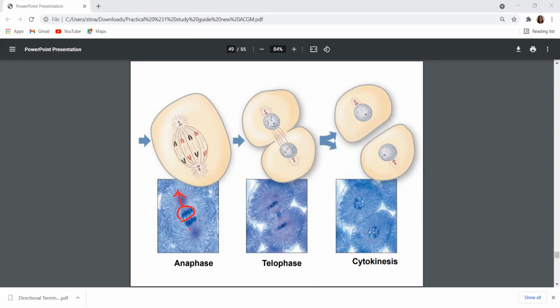And then you have these chromatids or sister chromatids being pulled to this end of the cell, but they're pointing towards each other. So when you're looking at it, it looks like a bunch of fingers pointing to each other. So it kind of looks like this right here. Okay, where you see those sister chromatids being pulled to opposite ends, and the 2 sets of sister chromatids are facing each other, but you can see a little bit of distance between them.